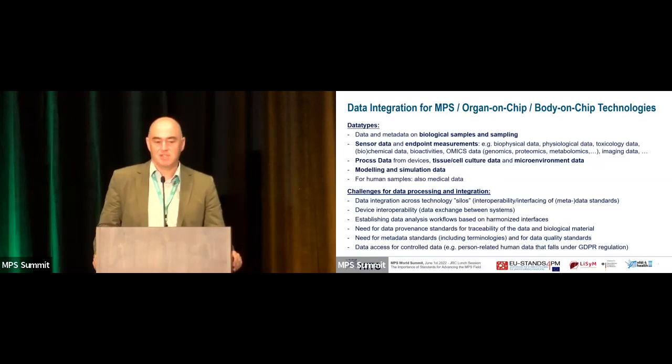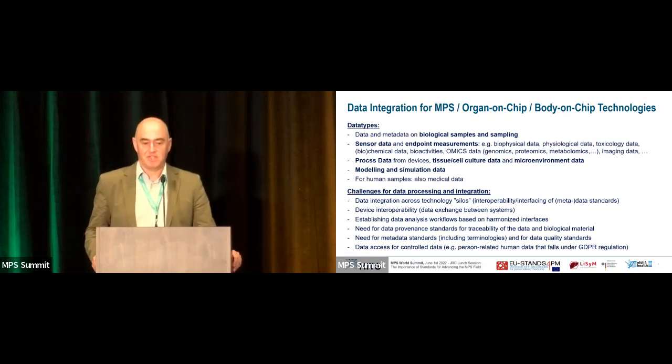And the challenges here for the data processing and integration also are that you want to integrate across the technological silos. So the data from the different parts and from the different readouts have to fit to each other, to be interoperable, to interface with each other.